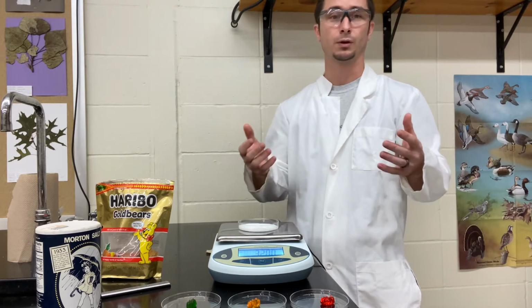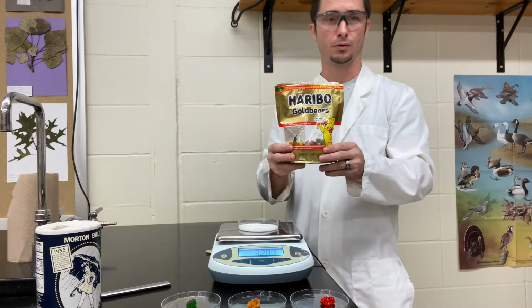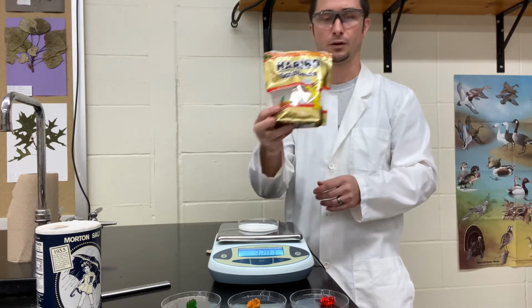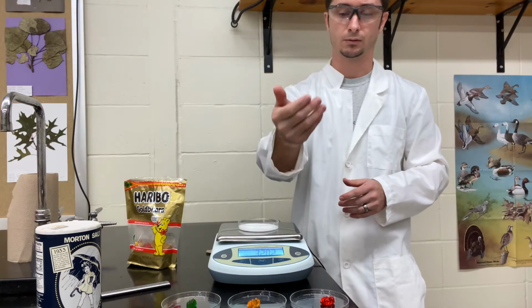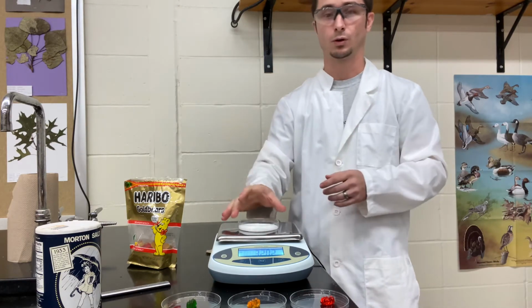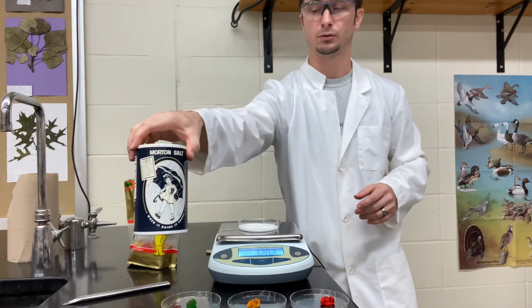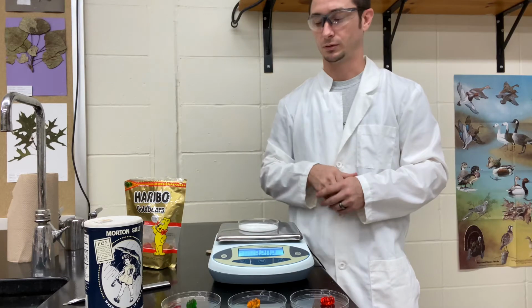So what are we going to be using today? Let's take a look at our materials. We've got our Haribo gummy bears, different color varieties there. We have 3 volunteers today, the green, the yellow or orange, and also red. So we're going to be using those. We're also going to be using some salt, normal salt that you can buy at the store, and we're going to use 32 grams of it, which I've already measured out.